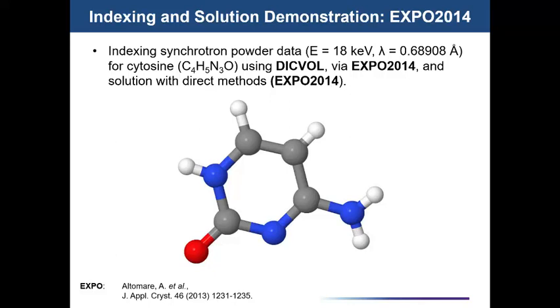So now it's suggesting what it thinks are the possible space groups. This top choice has the highest figure of merit, and in this case, this is the correct choice. This can be tricky sometimes. Sometimes you have to look at a few different space group options and try and figure out for yourself what you believe is the correct choice. A nice sign with this one is that for orthorhombic, P212121 is a very, very common space group, particularly for organic structures. So that's a very good sign that we probably have the correct space group here.